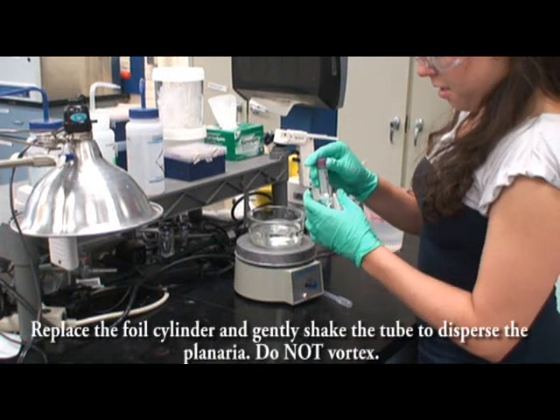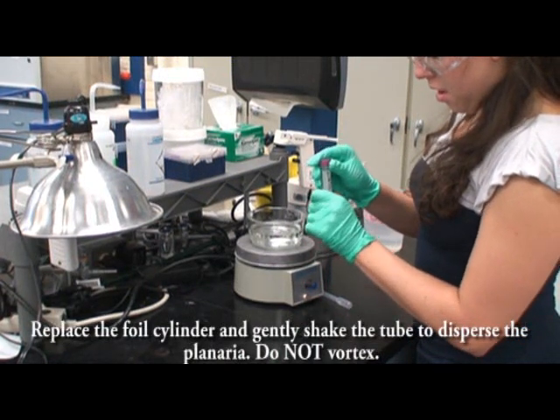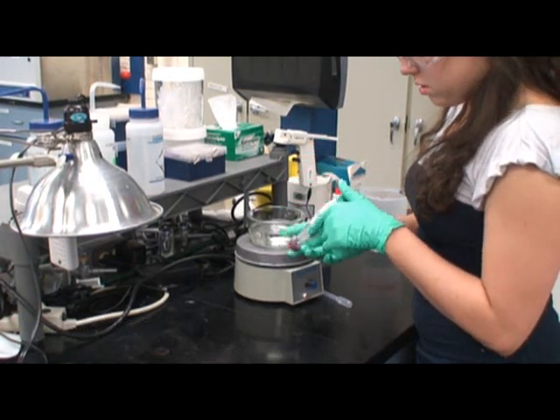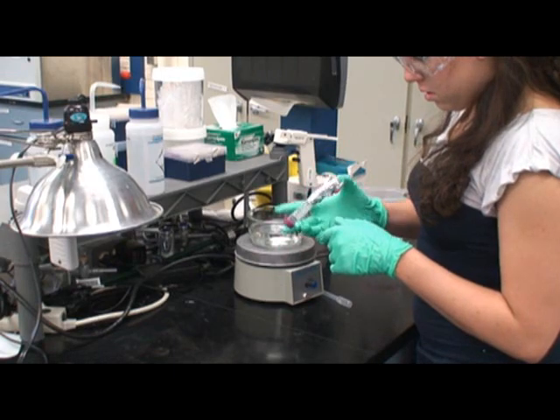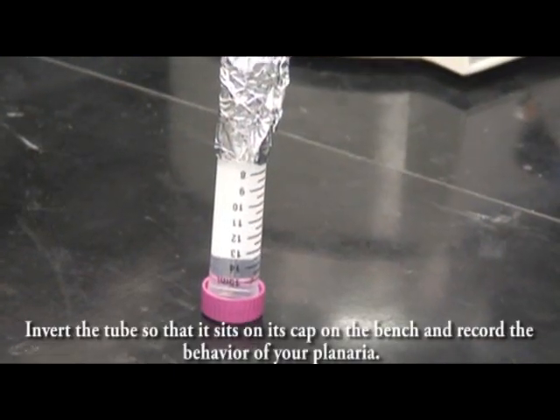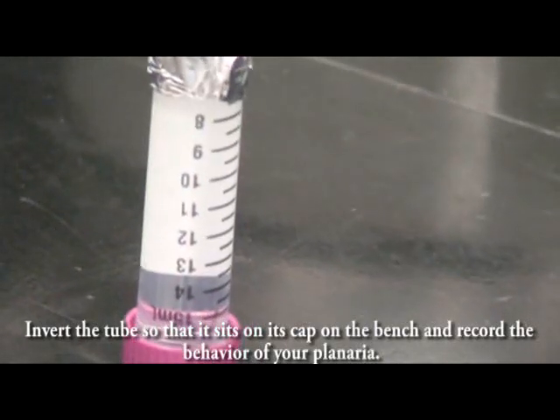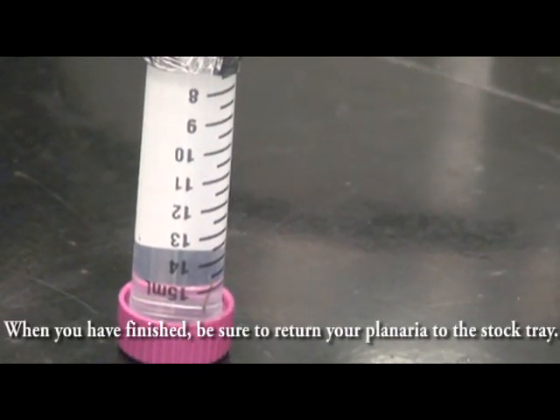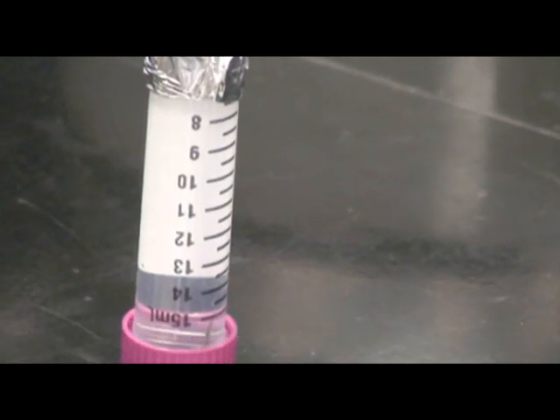Replace the foil cylinder and gently shake the tube to disperse the planaria. Do not vortex. Invert the tube so that it sits on its cap on the bench and record the behavior of your planaria. When you have finished, be sure to return your planaria to the stock tray.